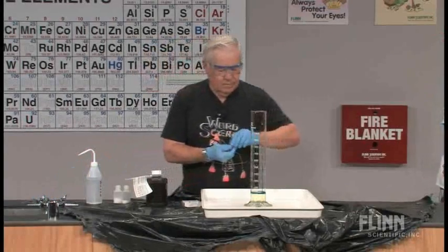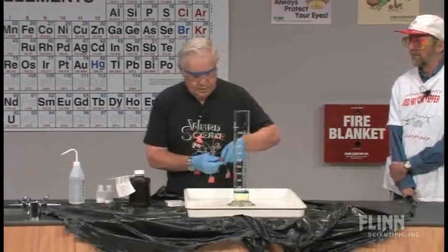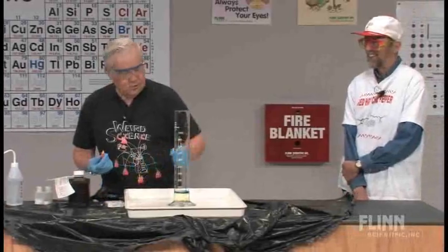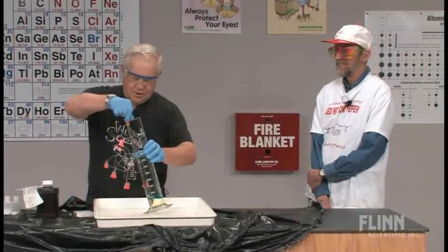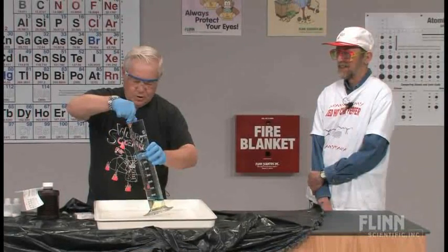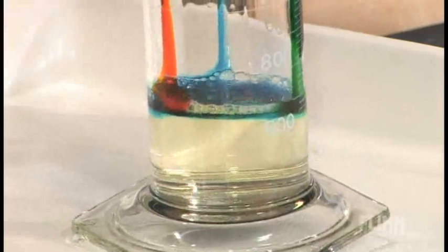You know, I bet the problem is that they're using clean glassware here. Yes, when I do this in my lab, I have no problem. The colors just stay right on the side of the tube, but here we are.